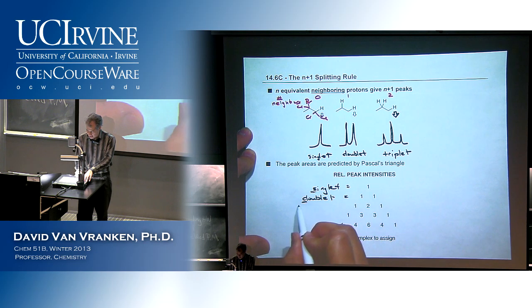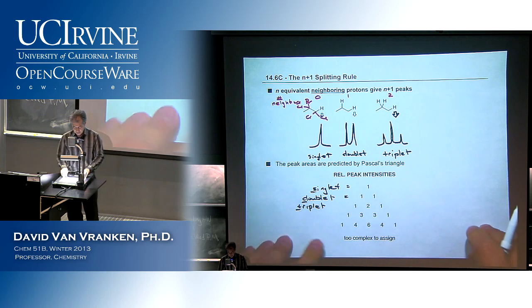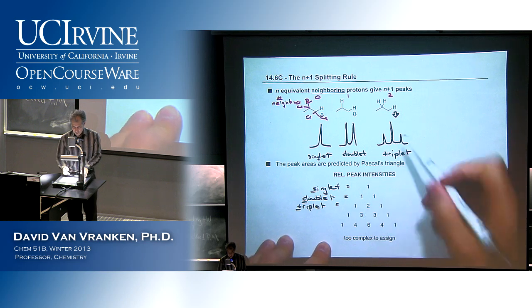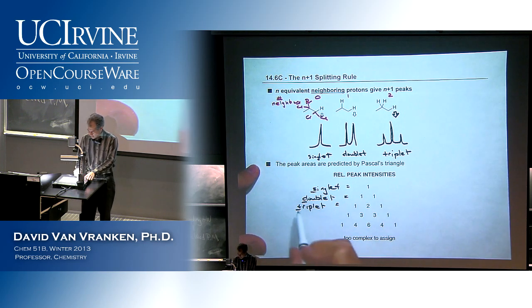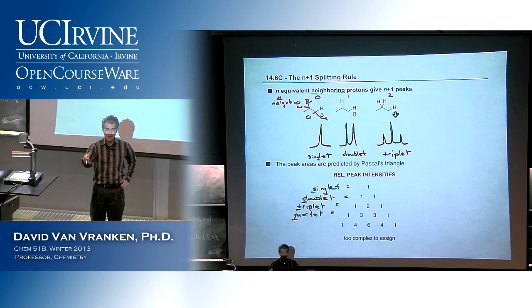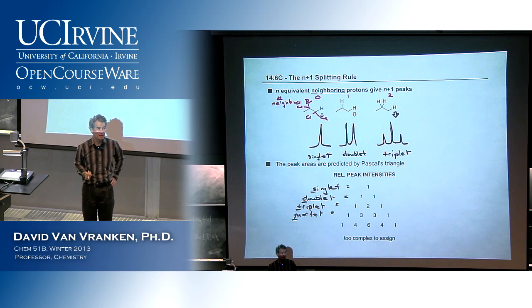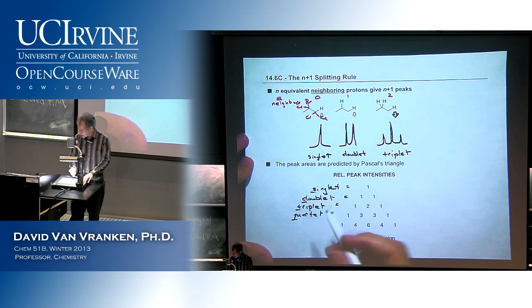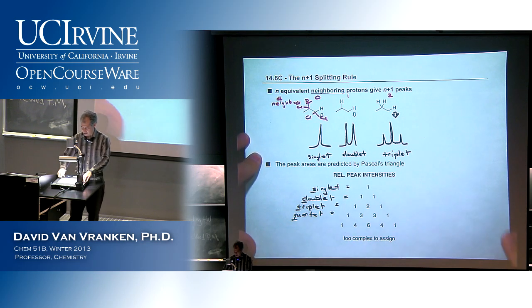And if you see three peaks, if it really is a triplet, we would symbolize that with the letter T, and those peaks, for the statistical reasons I showed you, should appear in a 1 to 2 to 1 ratio. And then finally, a quartet. So you see how the language works. We symbolize with the letter Q. The peaks will appear in a 1 to 3 to 3 to 1 ratio. If they are not approximately 1 to 3 to 3 to 1, then I would worry that maybe that's not a regular quartet. And you can keep going all the way down to a septet, with seven peaks or more.